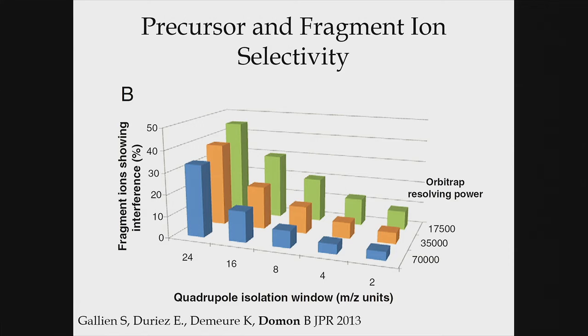So this is kind of if you're looking at the future of DIA, right? As instruments get better, as multiplexing methods improve, right now we're around here, but later on we'll be down here. So we already know that there's a lot of improvement. And of course, resolving power increases as well.